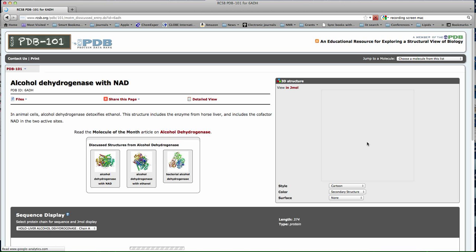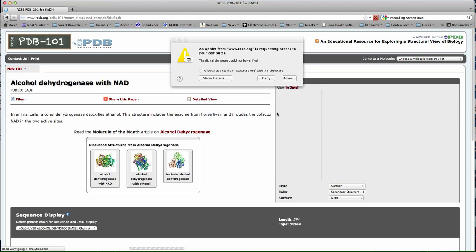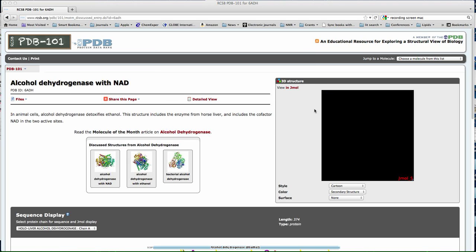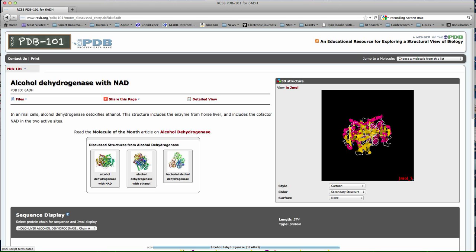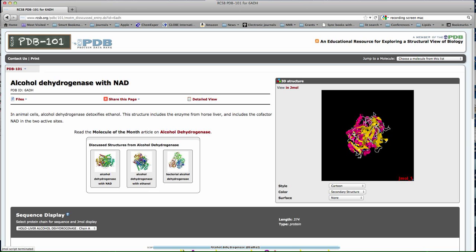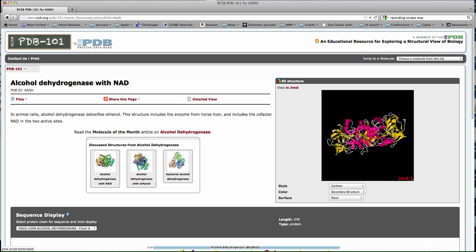Right. Now here, a window will open if you've got the right software installed that will allow you to take a quick look at the protein. There it is. You can use your mouse to move the protein around. There we go.